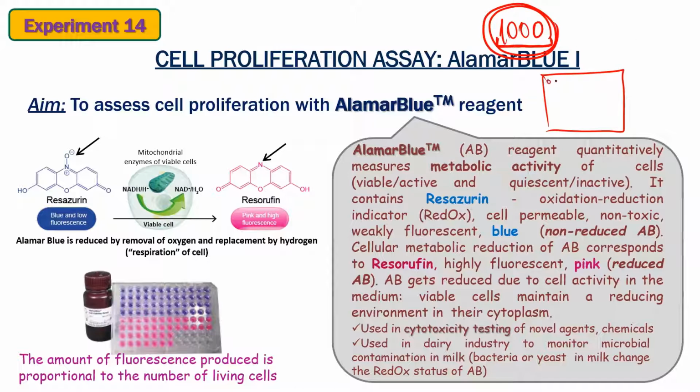So what we do, we take this plate. Let's say it's a 384-well plate, and we need 3 of them to cover only one cell type and all those 1,000 molecules. So we seed our cells, and then we take time points and measure fluorescence. Let's say we take only the first molecule out of these 1,000, and we build a plot. We measure every hour and see how the cells behave.